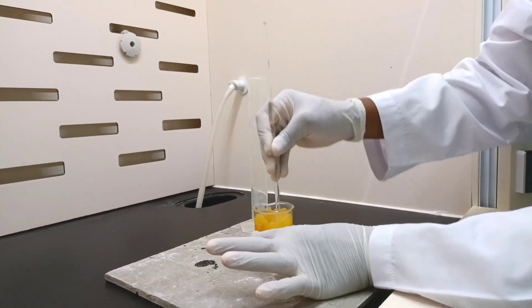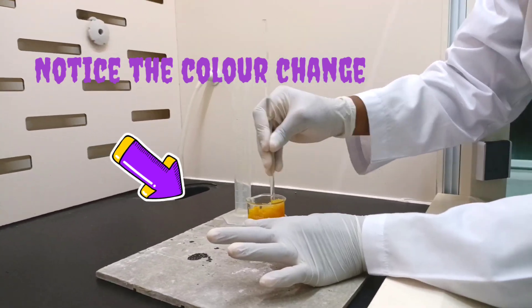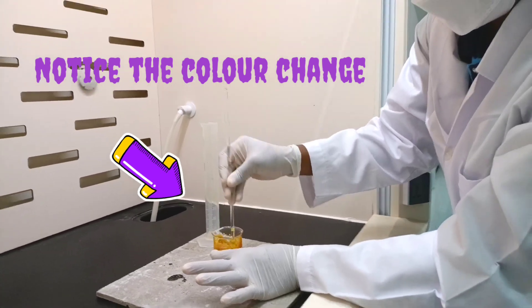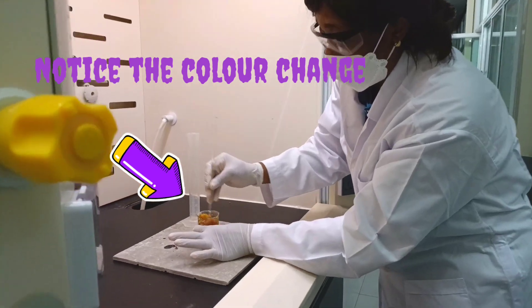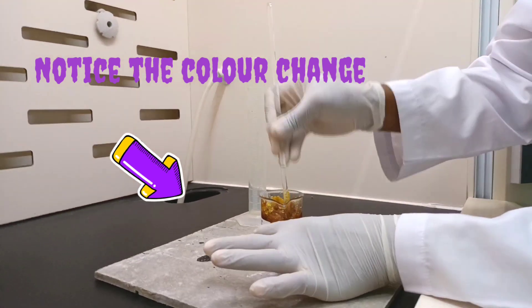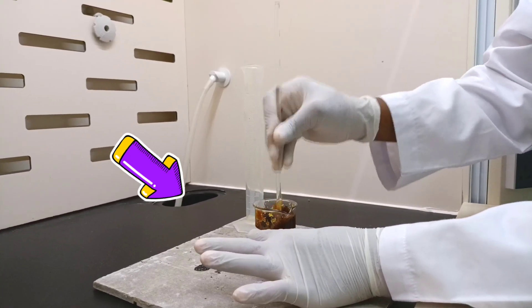Next I'll stir the reaction mixture. You will notice the gradual change in the color of the sucrose — it's gradually changing from white to brown. As I give it a good stir all around, you can see the color keeps changing from brown to black.